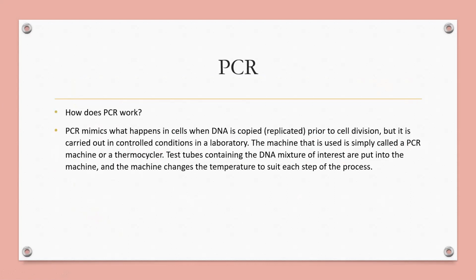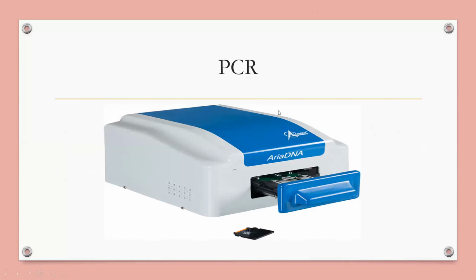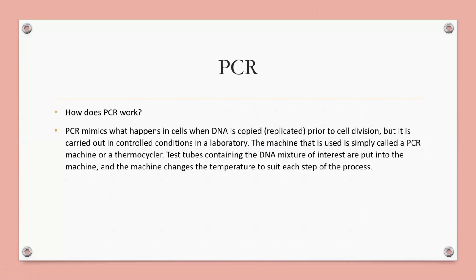Next, how does PCR work? Look at here. This is the PCR machine.